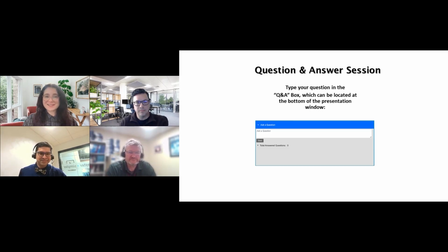All right, fantastic. We'll move to our next question, which Eddie, I think this may also be for you. So putting you on the spot again, would you be able to elaborate more on the benefits you saw with benzo B/K and why is it important? Yeah, so benzo B and benzo K fluoranthene, it's a common topic around the lab. So these two compounds are two PAH isomers that behave pretty much chemically identical. They elute very, very close together, and as you could imagine, it's hard to chromatograph out with a bad column or with an improper column.